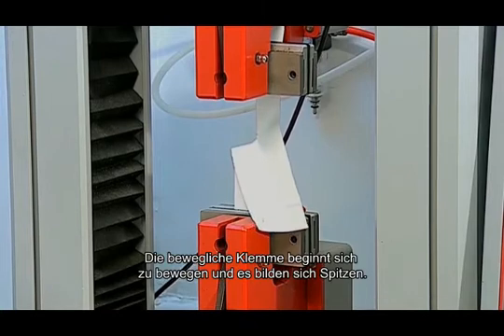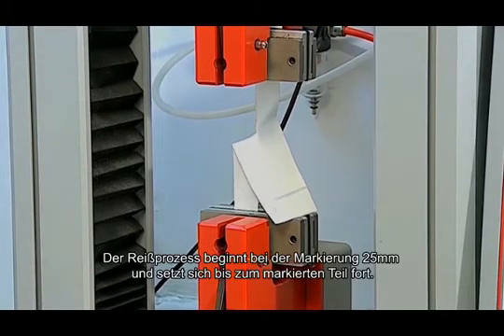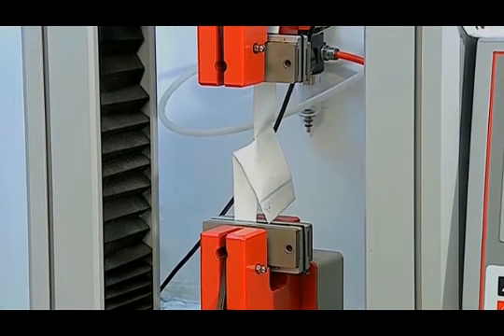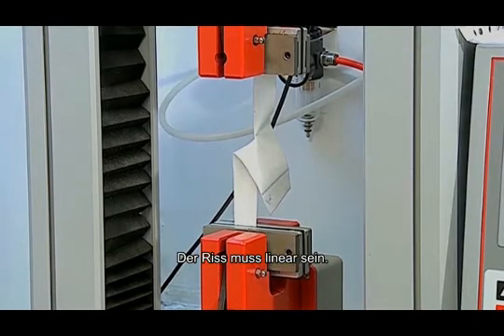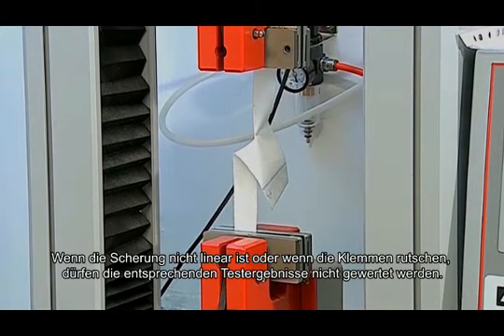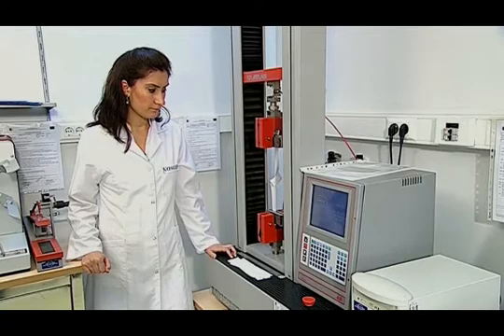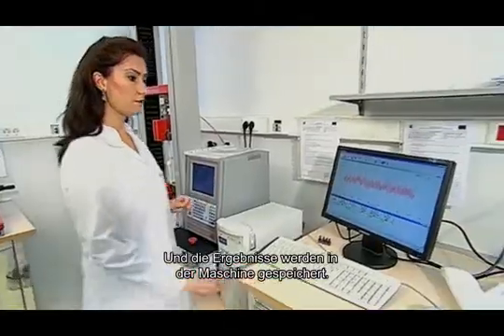The movable jaw begins to move and peaks start to form. The tearing process starts from the marked 25 mm and continues till the marked section. It must be made sure that there is no slip in the jaws when the sample is tested and the tear must be linear. Test results are not taken into account if the tearing is not linear or if the jaws slip. The test is terminated when the marked section is reached and the results are saved on the device.